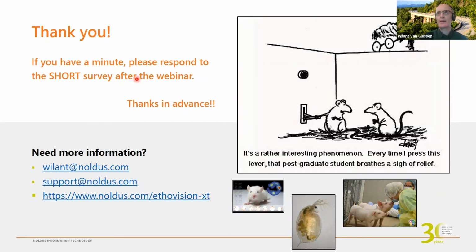You want to keep everything contained in separate experiments and just launch a different experiment for different groups, or make an additional variable in your trial list when you switch from one group to another, and keep it organized that way. Like group A, group B, group C. But they may be referring to something slightly different. So again, feel free to contact us with that more specific question.